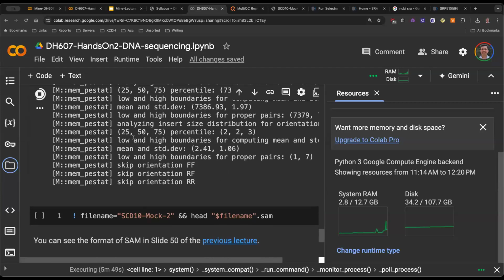So people who have used tools before, or where is Fennel? Fennel is not there. Okay. Anyone else who has used BWA or alignment or done any kind of this work before? Mostly maybe people from the biology background. Naved?